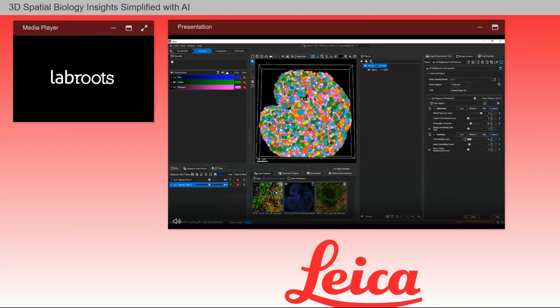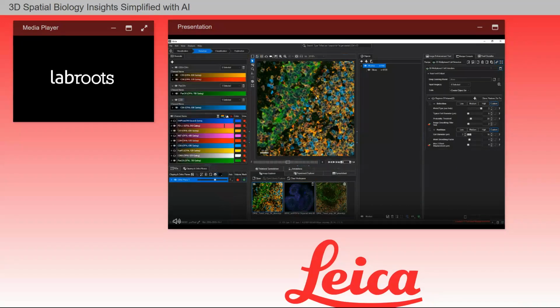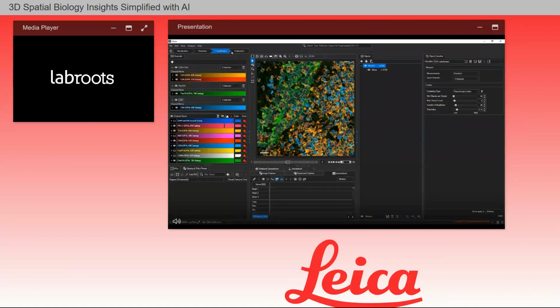Let's go back to the multiplexed image. Now that I have the segmentation of all of my cells, let's identify the cell types. Click on the classification chevron to go to the classification tab. The previous tab with the recipe console is now replaced with the object classifier tab. I am going to select my pre-trained phenotyper from the drop-down menu and apply this to the mesh object set.